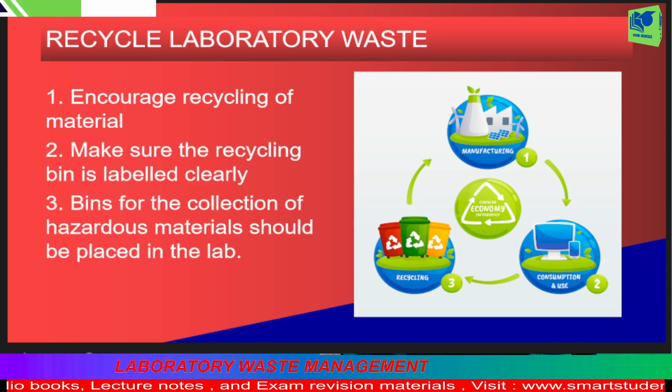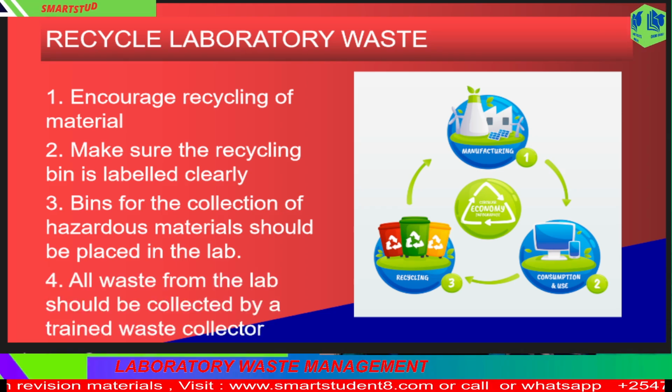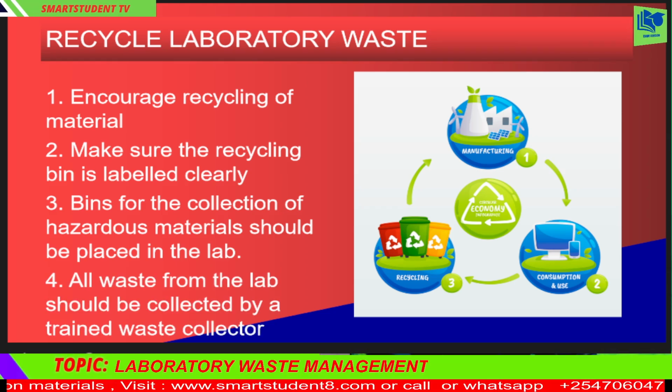3. Bins for the collection of hazardous materials should be placed in the lab. These should be emptied regularly and looked after by lab personnel/technicians. 4. All waste from the lab should be collected by a trained waste collector who is specialized in hazardous waste collection and who is licensed to treat and dispose of the waste.